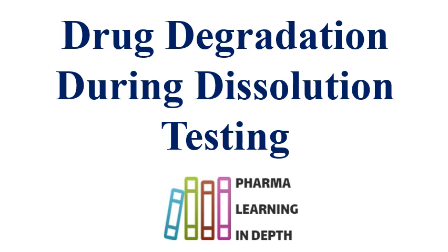Dissolution testing is a performance testing for formulations. Dissolution testing is related to bioavailability, and it is an in vitro test to predict the in vivo performance of the formulations. It is a performance test and a quality parameter, and directly related to safety and efficacy. So, accurate dissolution test results are much important and required.